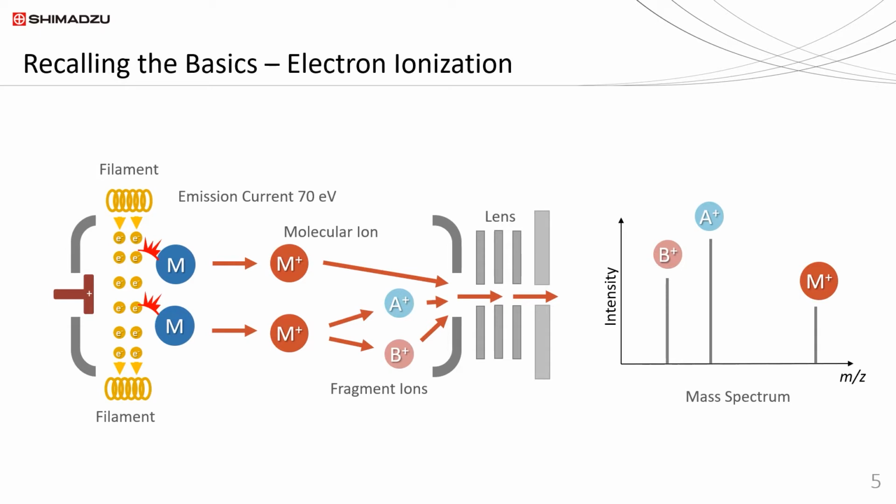The ion source is a very important part of the spectrometer, because only ionized compounds can be successfully detected. To create ions, a stream of electrons is provided to collide with the compounds. In most cases, the entire molecule will be ionized to form a molecular ion. However, since a very high electron emission energy of 70 electron volts is used, the ionized molecules are usually fragmented into smaller pieces, called the fragment ions.